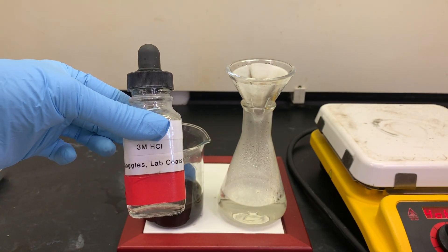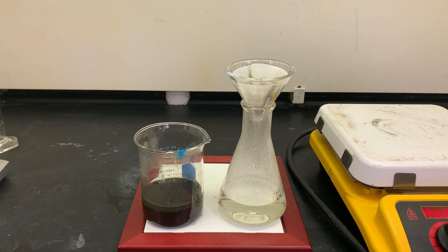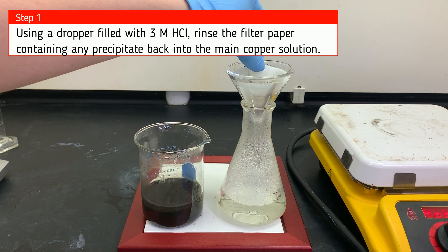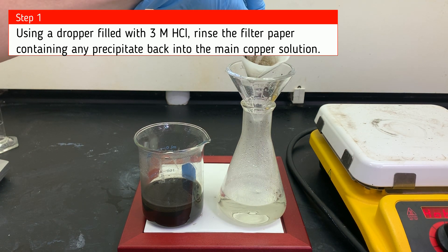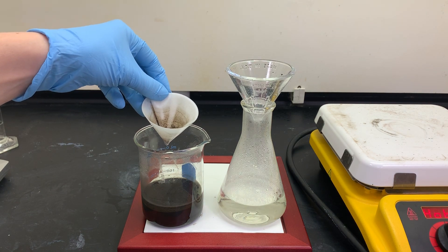The first thing we're going to do is use a dropper filled with three molar hydrochloric acid. We're going to rinse that filter paper that contains that black precipitate — that's some of that copper oxide from the previous reaction — and wash it back into the original container using hydrochloric acid.